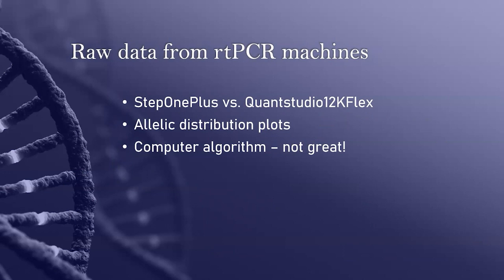So moving forward, we're going to look at the 2 machine softwares and how to look at the data on there, but also how to export it, which isn't particularly difficult, but just so that you have that visual of where the export button is and all of that.